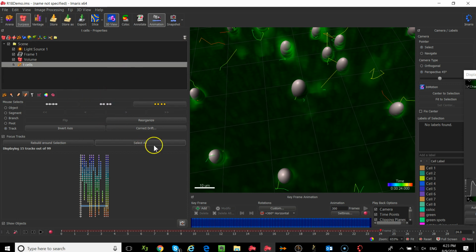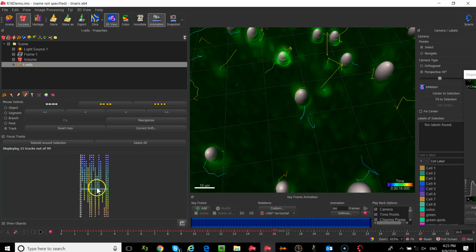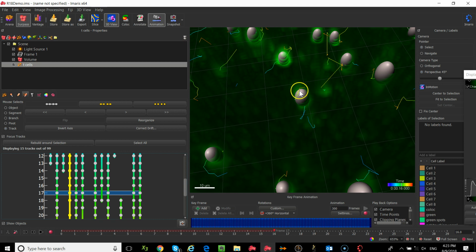And then we also have an option here if you do want to connect 2 tracks that should be the same track. You would select 2 options and you'll see that this option here will allow you to take the start or the end of one track and connect it to the start of another track. So all of these can be done either by selecting these objects or these tracks in your track editor, or you can select them over here and make the necessary adjustments.